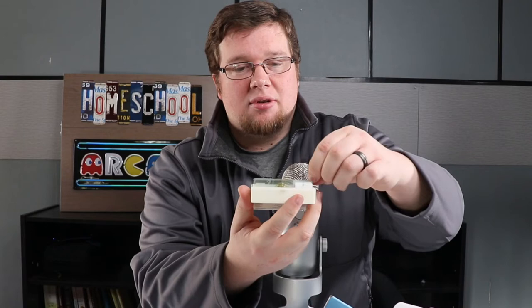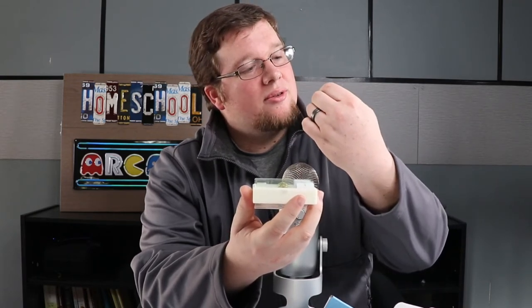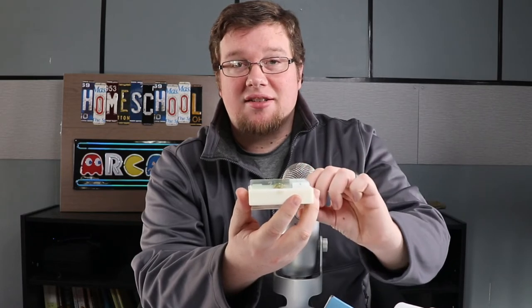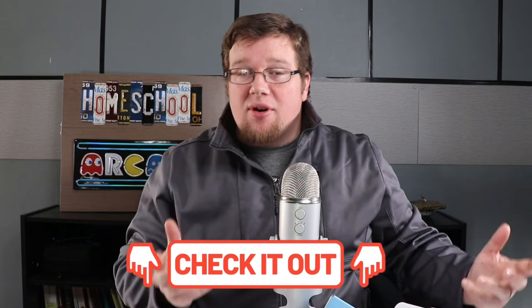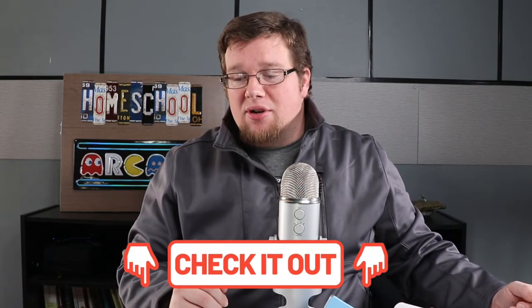These are genuine glass slides for you to look at different kinds of insects. There's a mosquito, and then this one is a honeybee mouth — very interesting. There are all kinds of adventures and things for the kids to experience trying one of these slide kits with their microscope. If you're interested in buying one, we have a link in our description that also gets you a 5% discount on any of these items.